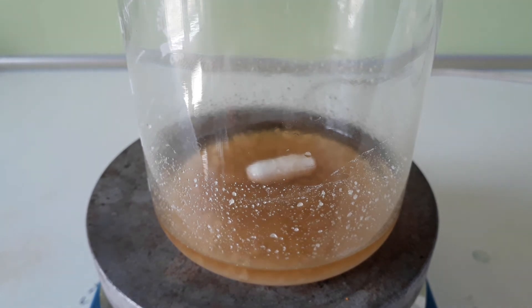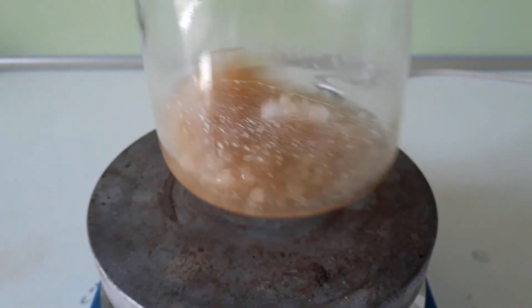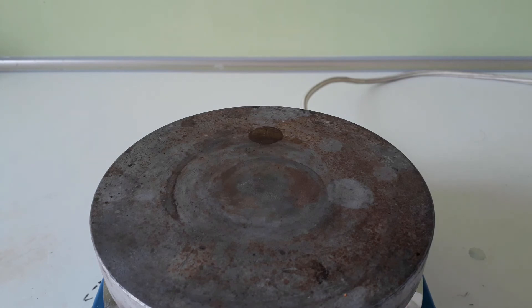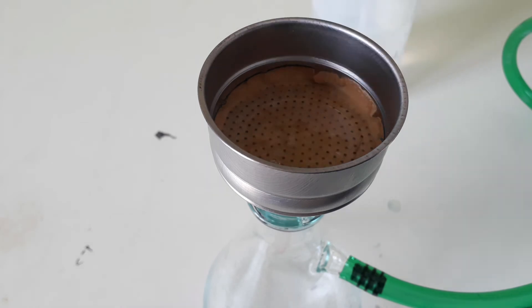In the end, I was left with much nicer, cleaner, and larger crystals of pyroglutamic acid. I filter the product and wash it with a little bit of water and then twice with ethanol.